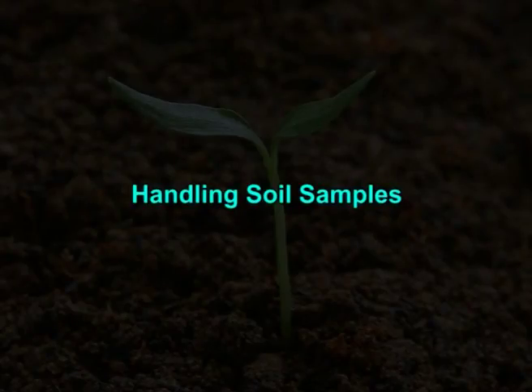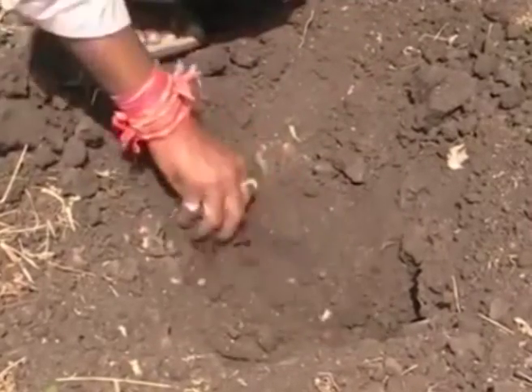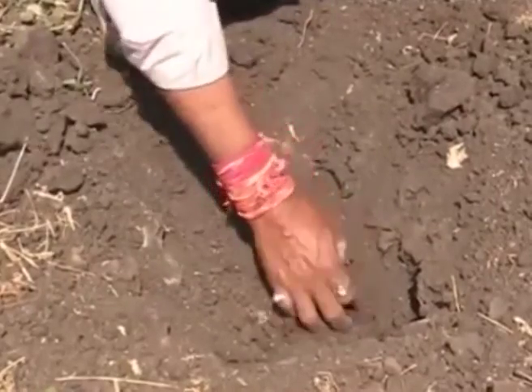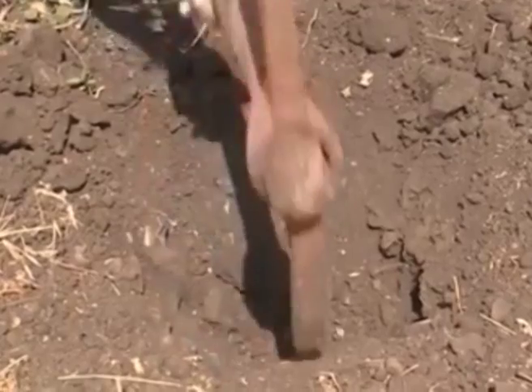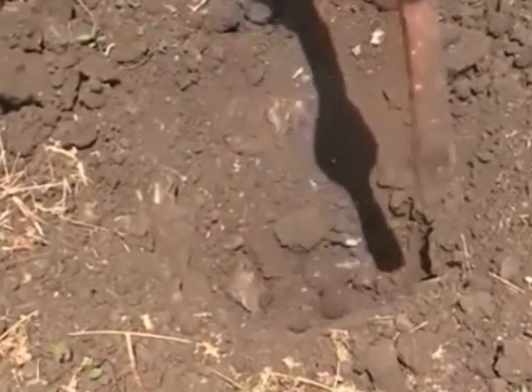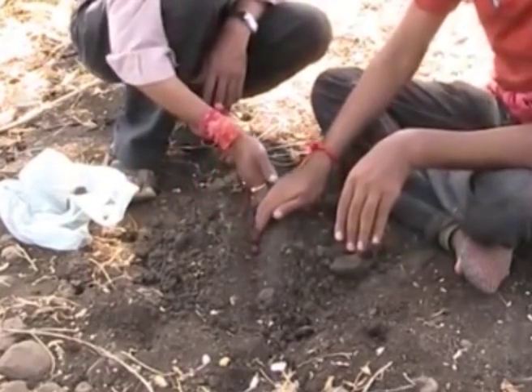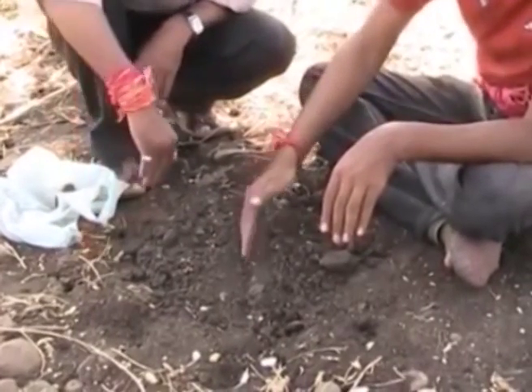Handling of soil samples. When soil samples are collected, the biological vitality of the sample should be preserved, because the extraction and identification procedure requires live nematodes to attain the best accuracy. Once collected, the soil and root sample should be delivered to the diagnostic laboratory without any delay.